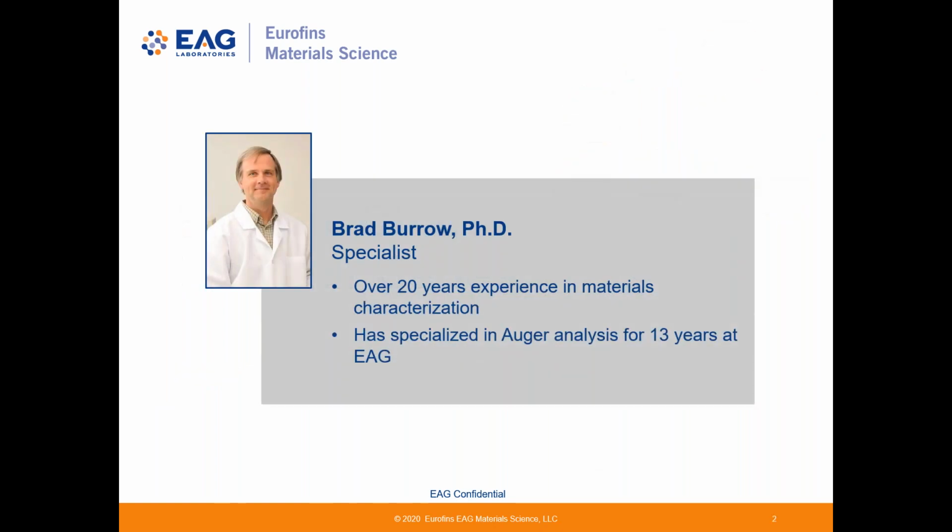I graduated from the University of Arizona with a PhD in analytical chemistry, where I used Auger to characterize anode surfaces in primary thermal batteries. I have over 20 years of experience in materials characterization using primarily surface analytical techniques. I have specialized in Auger analysis for about 13 years here at the Sunnyvale, California location of EAG Labs.